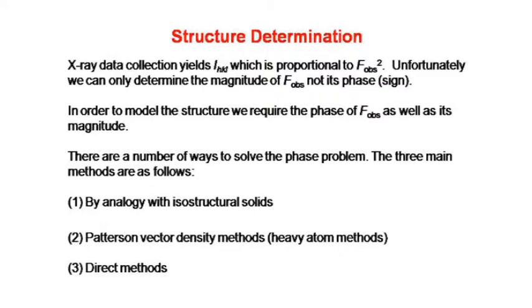So there are a number of ways in which we can solve the phase problem. And I'm going to talk, well, there are many more than this, but these are the main methods. And I will talk to you about each of these and explain to you how they work.